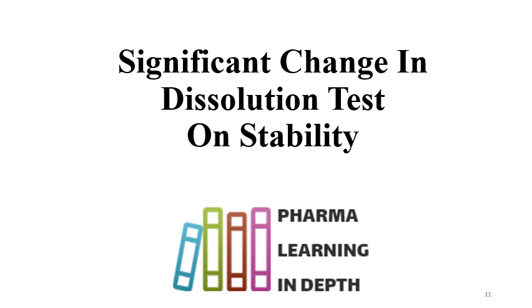So this is the information regarding significant change in dissolution test or failure of the dissolution on stability.